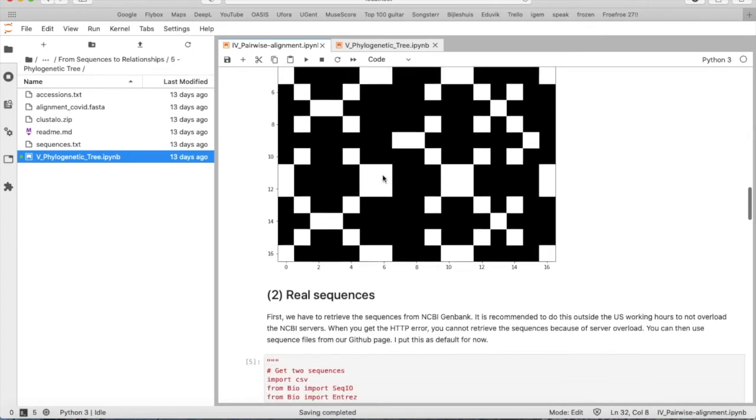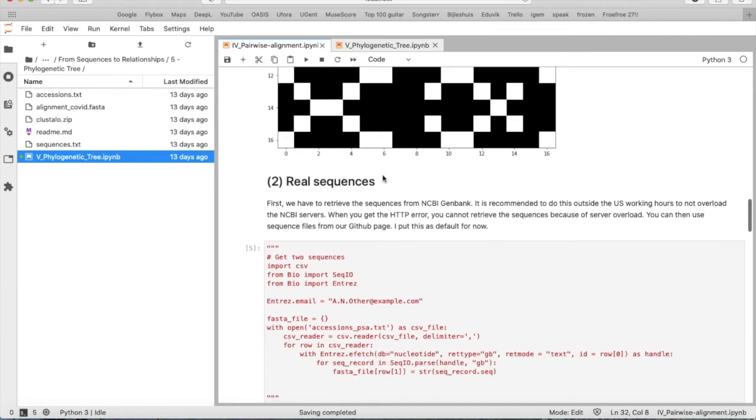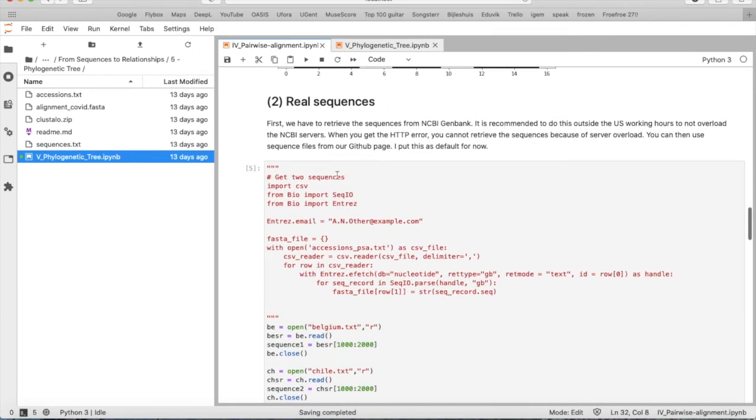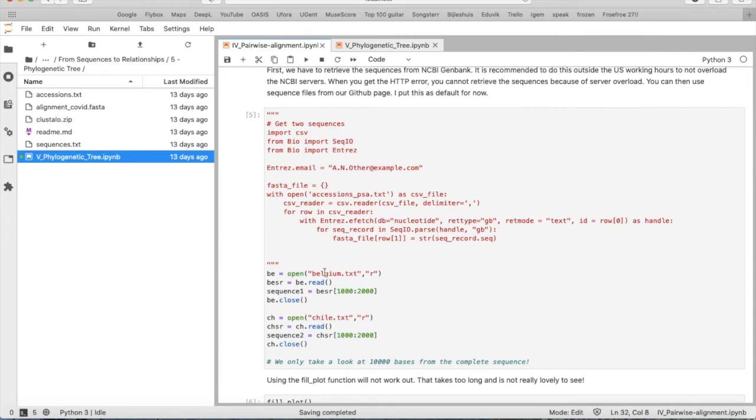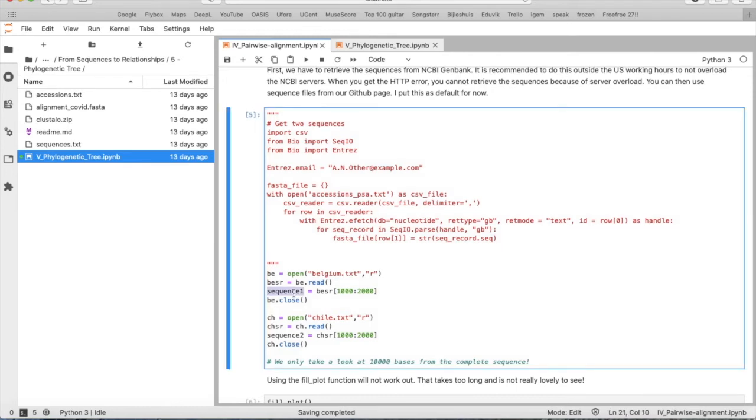And now move to some real sequences. So here we have the code to extract some sequences from NCBI GenBank. So which sequences do we choose? We first of all took a Belgium isolate of the SARS-CoV-2 virus and the strain from Chile. So we first of all open the file that we made with the sequence. We read the content of the sequence. And we say, okay, we only take 1000 nucleotides from the sequence. And this sequence 1 is from nucleotide 1000 to 1999.